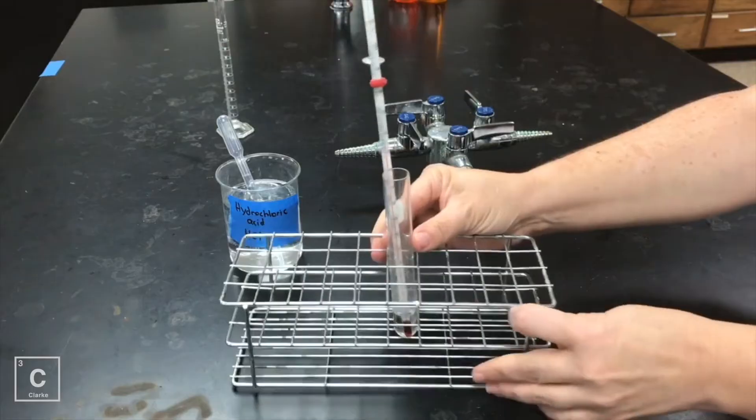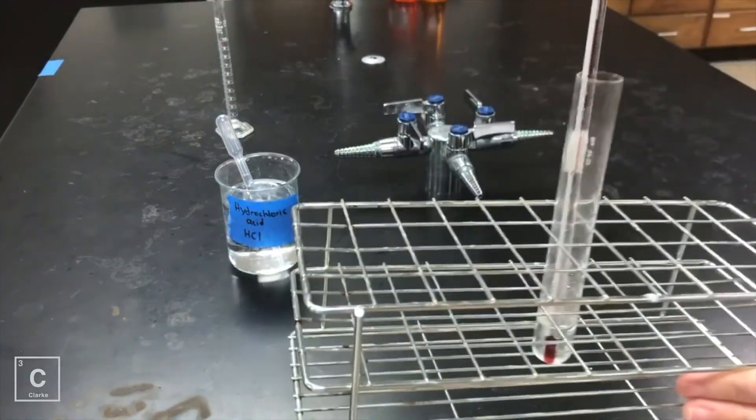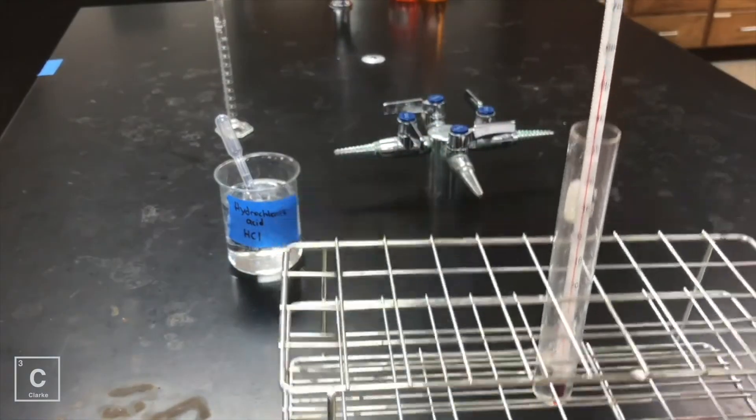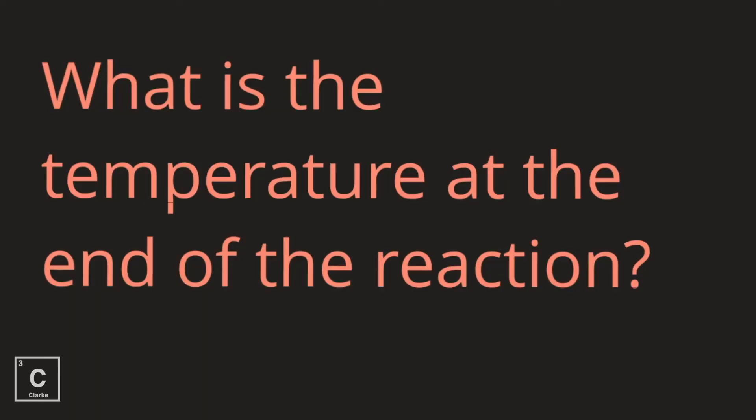I'm now going to put the thermometer in to take the temperature. I'm going to bring it up to the camera so you can read the temperature. What's the temperature at the end of the reaction?